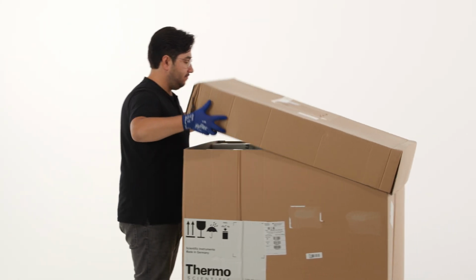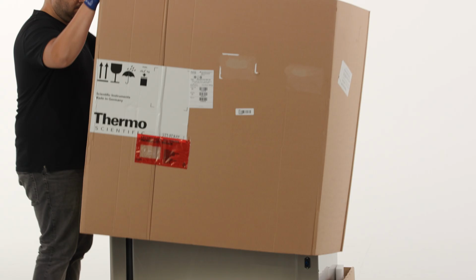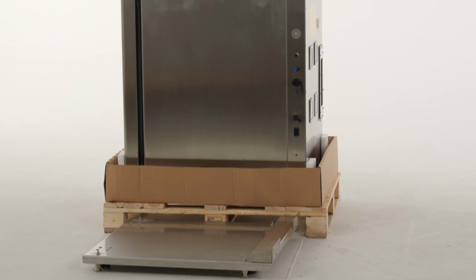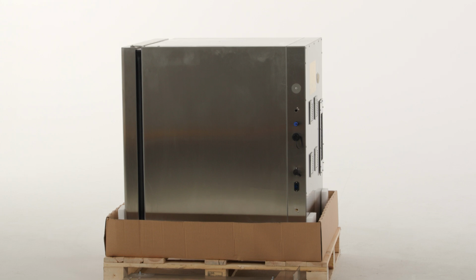Upon delivery, check immediately for completeness and possible damage. If components are missing or damages found on the device or the packaging, especially damages caused by humidity and water, please contact the carrier as well as our customer service team immediately.